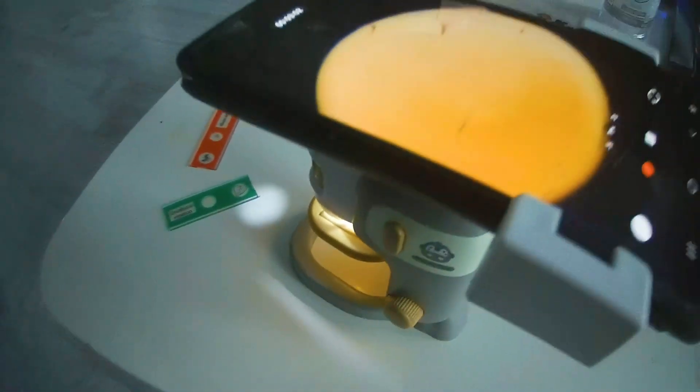Inside here, you're going to find other things, as well as a screwdriver and one single battery. So we're going to take this off. You're going to take the battery that's provided. Again, always recommend getting yourself chargeable batteries. Alright. And there's your light.